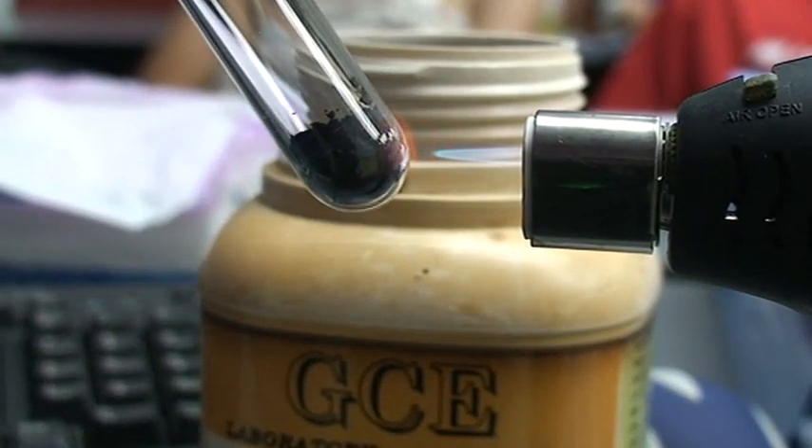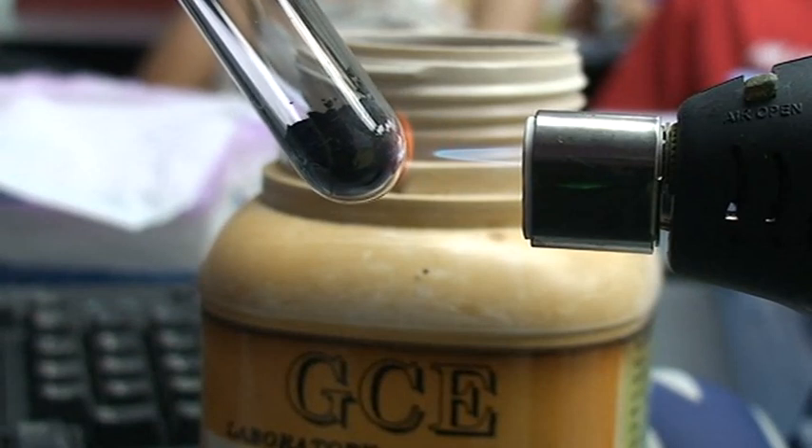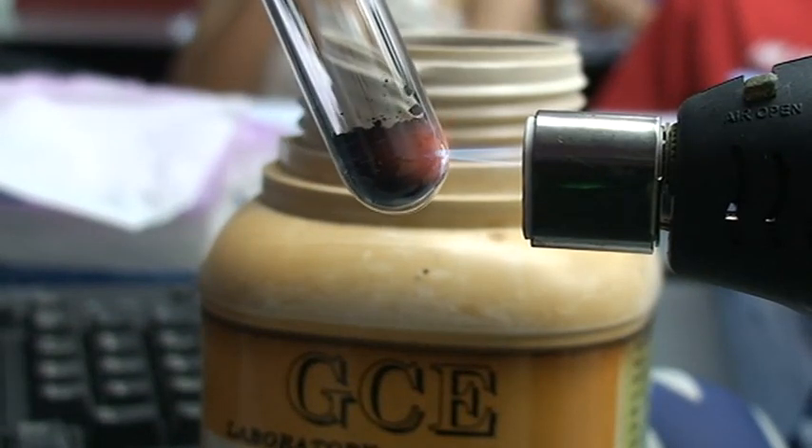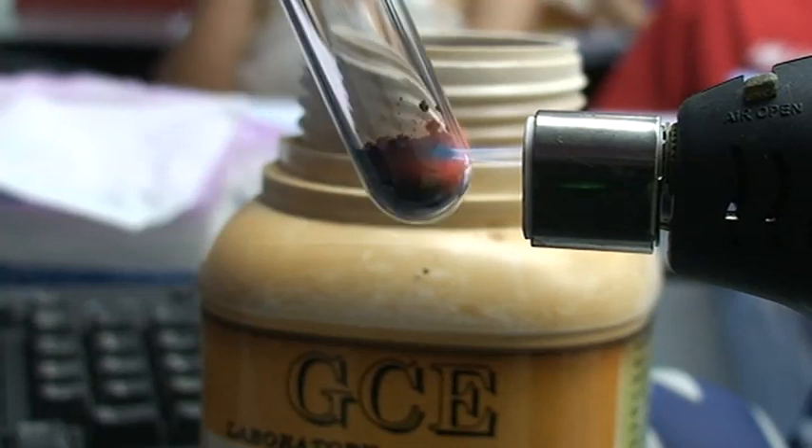In a moment, as it melts, we are going to test the oxygen that's going to come out from there.